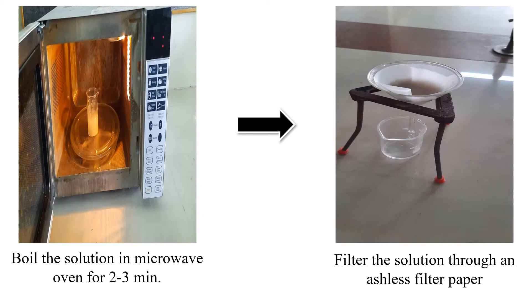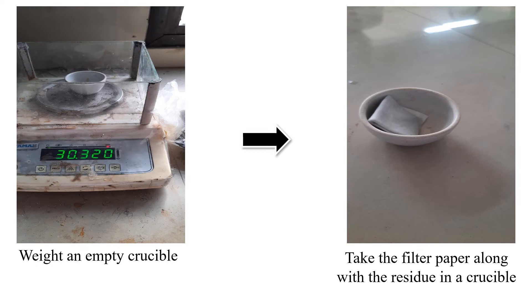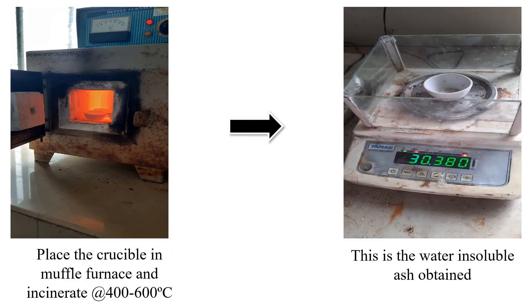Boil the solution in the microwave oven for about 2-3 minutes. Filter the solution through an ash-less filter paper. Weigh an empty crucible. Take the filter paper along with the residue in the crucible. Place this crucible in the muffled furnace and incinerate it at 400-600 degrees Celsius until whitish to greyish ash is obtained.